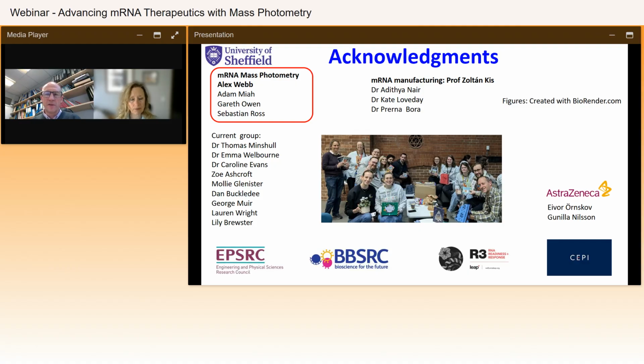Yeah, it's a good question. I think there's a few different components in that one. First and foremost, we're essentially using the magnesium to stabilize the RNA-RNA interactions. But the question's right that the magnesium can cause various different effects. Essentially, we chose to use 1 millimolar magnesium because that represents physiological free magnesium concentration. So we're using at or around what the physiological concentration in the cell is.